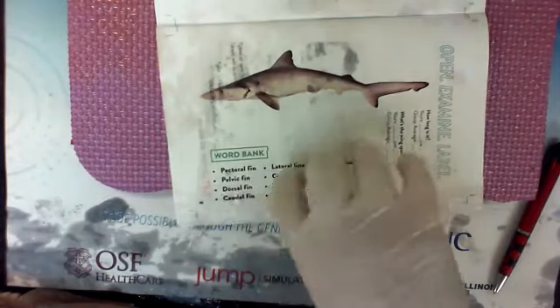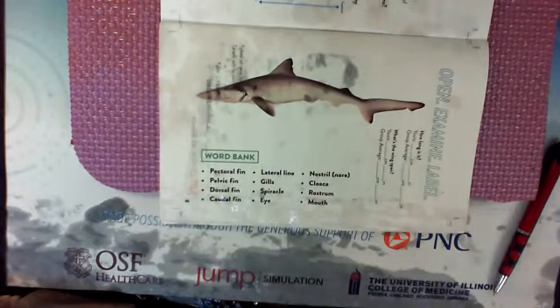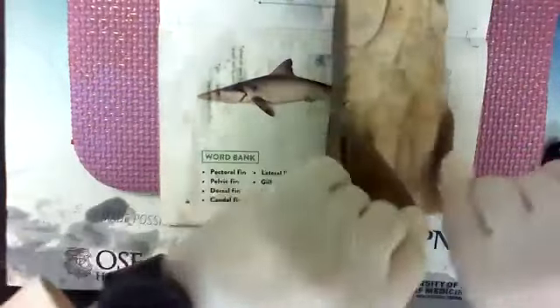Okay, so the dorsal fin helps you identify where it is. How about the pectoral fin? Think about humans. Where's the pectoral region on a human? When I think of pectorals, I always think of bodybuilders going to the gym, like, hey man, look at me, I'm buff. Right? So the pectoral region's right through here.